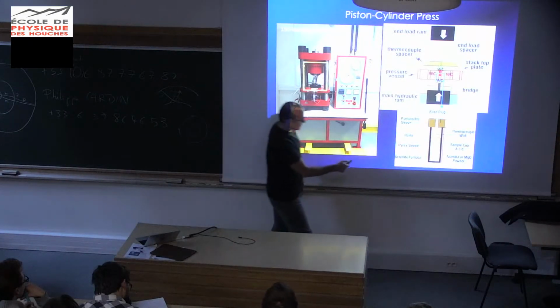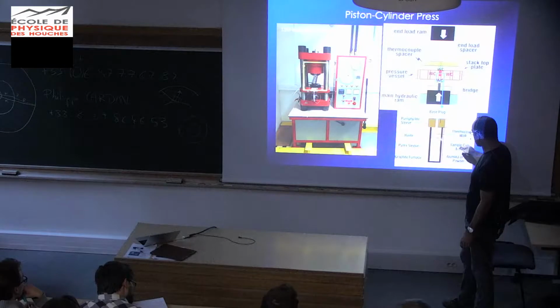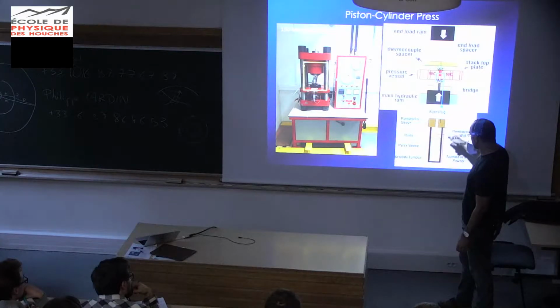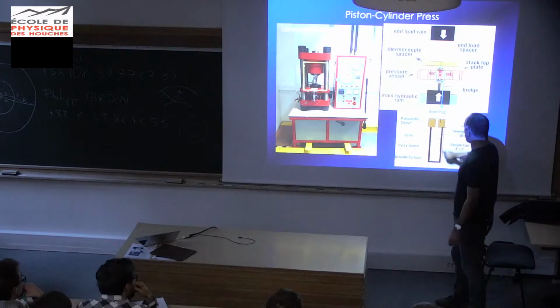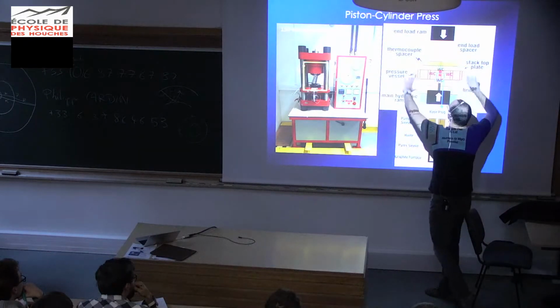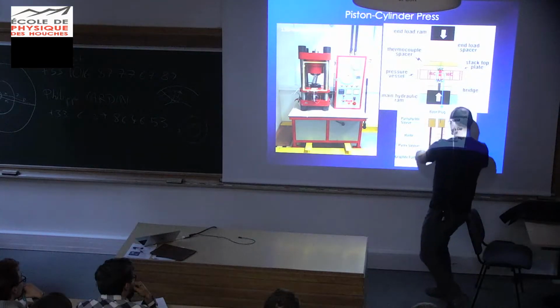So your sample actually sits here. Actually, let me show you on this slide. And that's basically the sample you're interested in. That's a capsule that sits around the sample. This is basically a thick MgO buffer that's holding the sample together. And what's important is this black part here. That's a graphite sleeve. And the reason why that's important is that this is the only electrically conductive piece of this whole assembly. So once you put this here, and you see those cables here, electrical here and here, you send about 600 amps through that thing. And this heats up to 2,000 degrees. And it's because electricity is only conducted by this. Everything else is insulating. So all the electricity has to go through this little thing and back out, and it has to go through the walls of this heater.